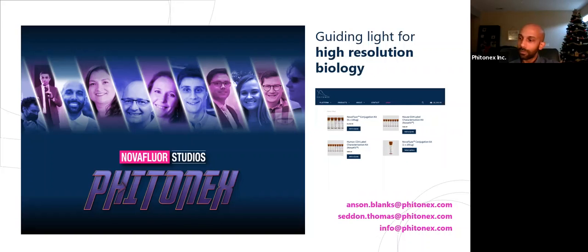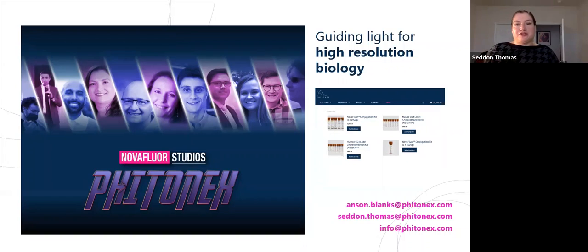So while we're waiting for some questions to come in, one thing I think is great to highlight on the website: if you are saying, okay, you've got all these colors, what is best for my panel? What we've done is really focus on the wave 1 fluors, but now we obviously have the Nova Reds as well. So you can see both the separation index and the spread into other channels, measured on an Aurora. That gives you some sense of how it is going to look.